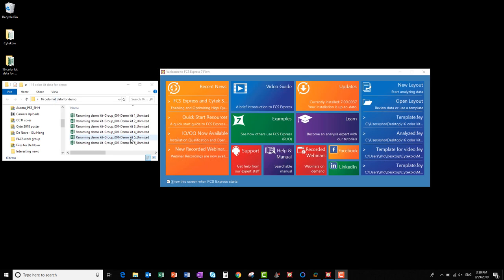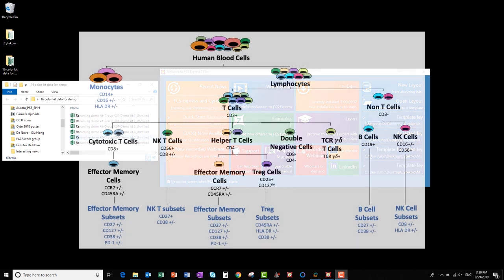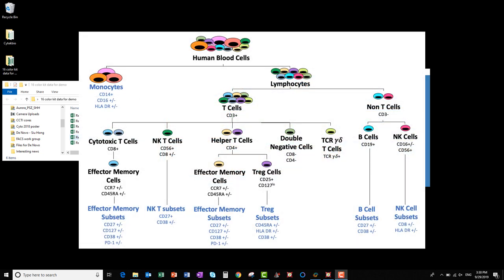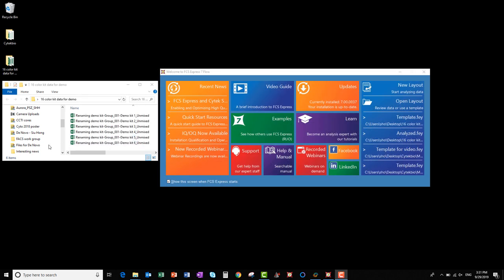Next, I'm going to show you an overview of all the markers present in this 16-color demo panel. The panel is for human PBMCs and has markers for many subsets such as monocytes, T cells, B cells, NK cells, and others. Now that you've got an overview of the panel, let's start looking at the data.